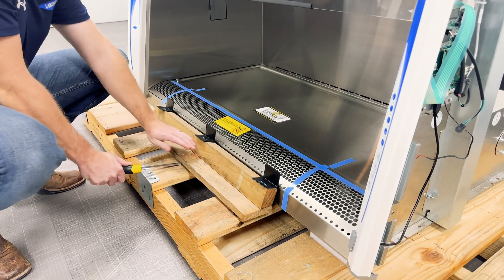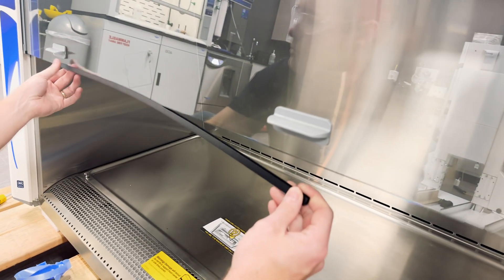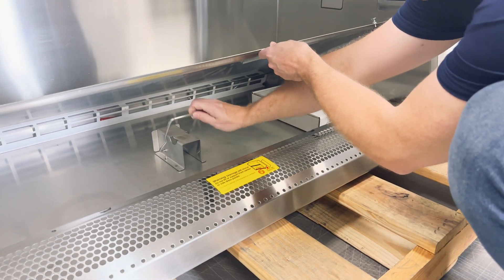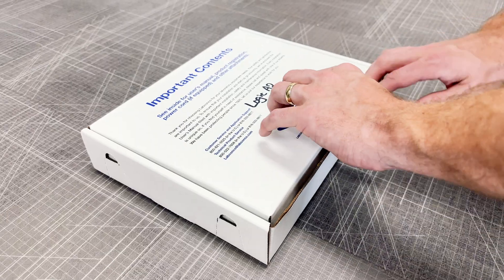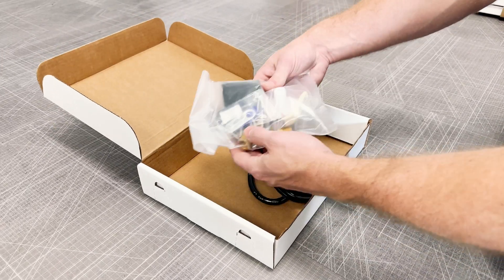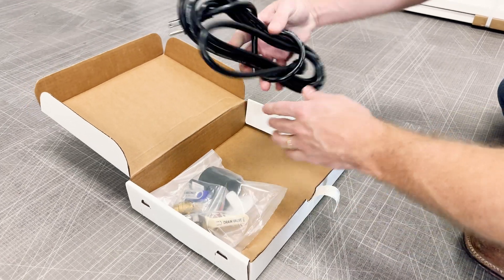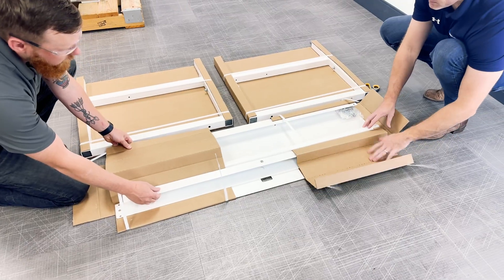Discard any packaging and protective pieces attached to the cabinet. Next, lift the work surface and remove the BSC parts box. Check the box to ensure all contents are present. This box should include a flash drive with the user's manual, a drain valve assembly with fasteners, and a power cord.